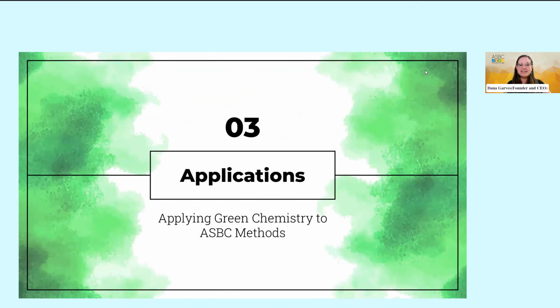All right, so here we go into how we can apply these chemical principles in the chemistry lab within the brewery. I am going to talk about just a few ASBC methods here. What I went for were ones that I think are unanimous across the board, that even the smallest beer labs might be running. I did not cover things that focus on HPLC or GCMS, because I don't think those are as broadly used, but I am always curious and collecting ideas for implementing green chemistry.